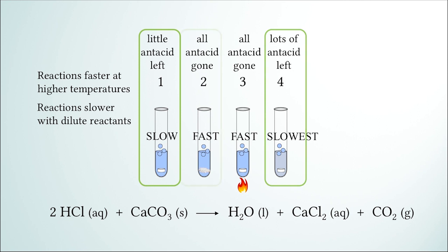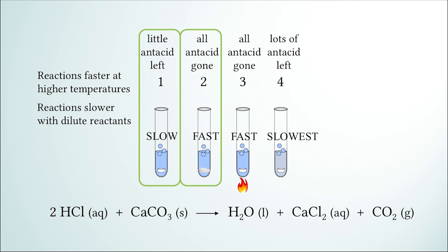Finally, look at test tubes 1 and 2. The difference between them is that test tube 2 had powdered antacid. It also had a higher reaction rate than test tube 1. So we can conclude that powdered solids react more quickly than non-powdered solids.